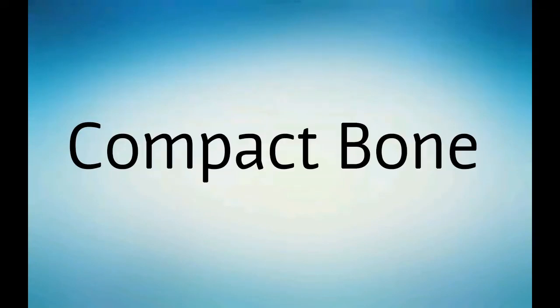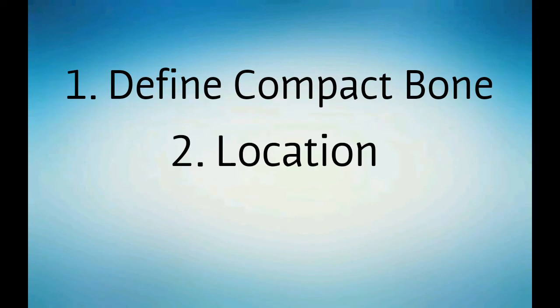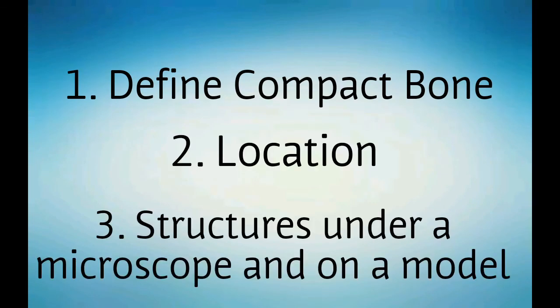For today's video, we will be taking a look at compact bone. We will go over what exactly it is, where it's located, and how to identify the parts of compact bone under a microscope and on a model.